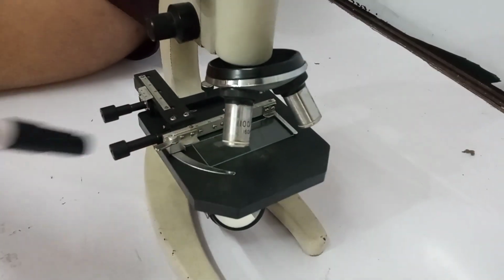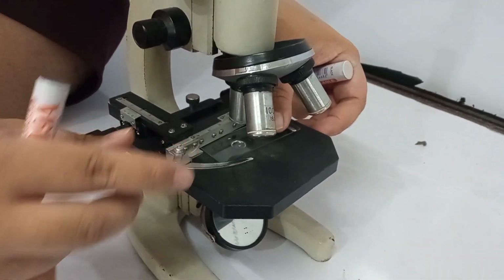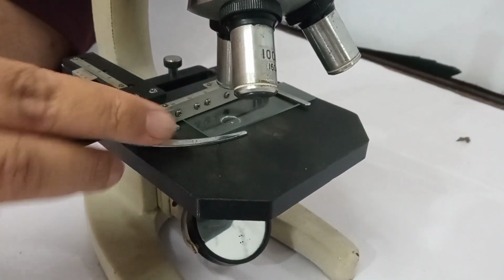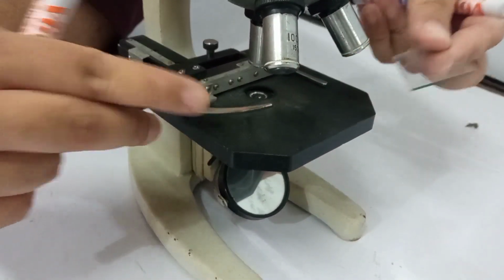This is the stage clip. Para kapag minumove mo siya, mag-move din yung slides. Medyo maluwang na ating stage clip.